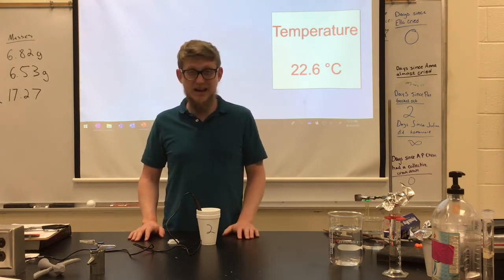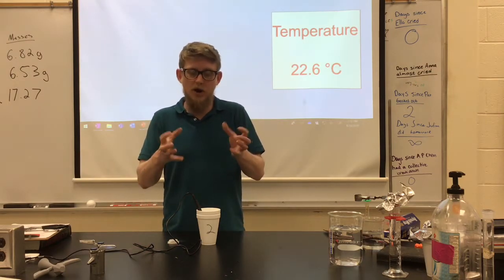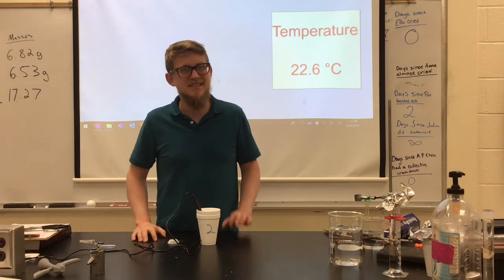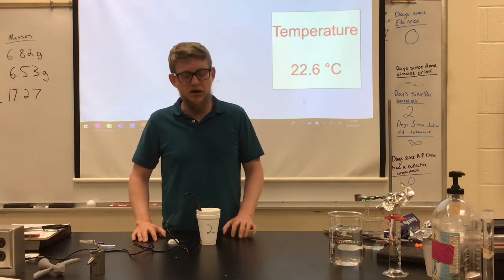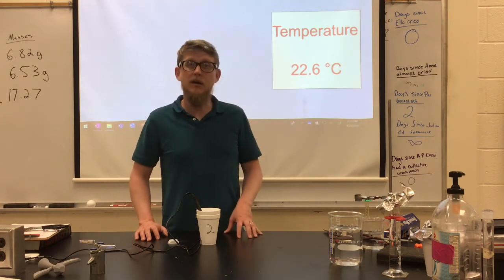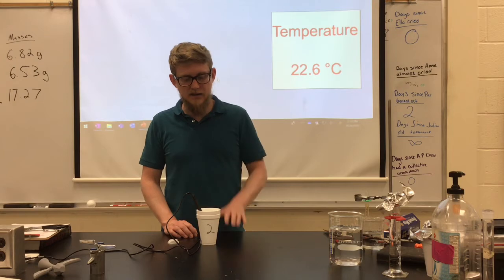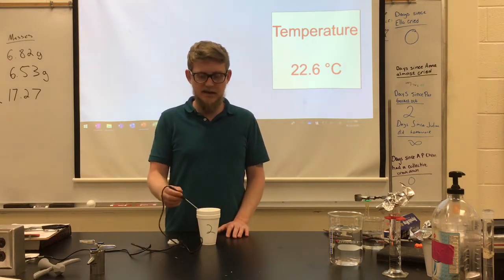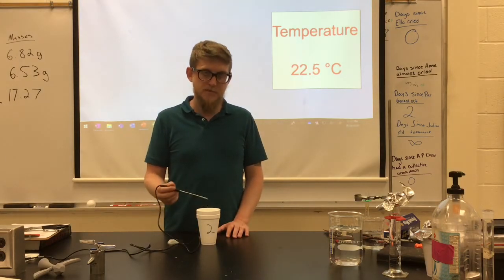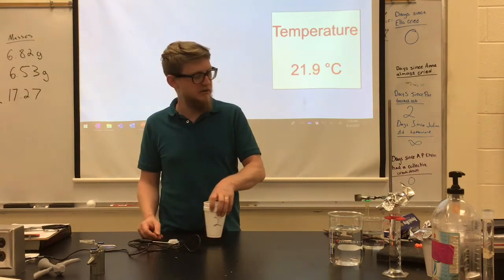Now this reaction got cold, meaning the molecules sucked energy in from the water, and so that means you should have a sign that is positive here on the delta H of solution. This is an endothermic reaction. Heat goes from the water into the reactants, okay? You need to calculate the heat of solution here in kilojoules per mole, and if you follow the analysis, you'll be able to do that.